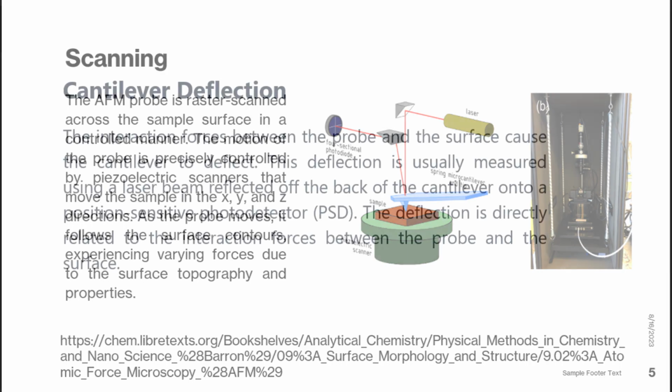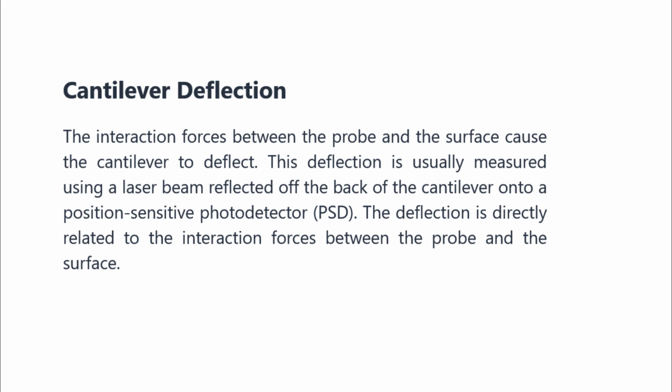properties. Cantilever deflection. The interaction forces between the probe and the surface cause the cantilever to deflect. This deflection is usually measured using a laser beam reflected off the back of the cantilever onto a position-sensitive photodetector, PSD. The deflection is directly related to the interaction forces between the probe and the surface.